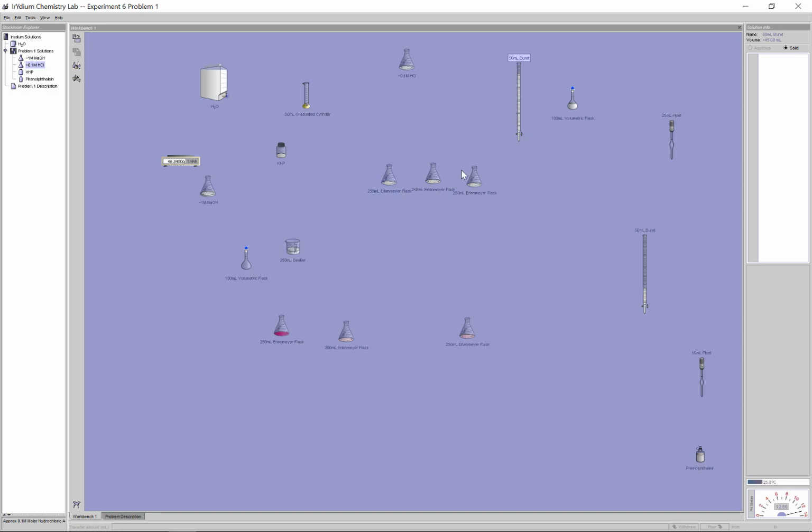Again, same problem. This one here would actually be colorless. So what I'm going to do here is I'm going to take my phenolphthalein here. I'm going to drop in a couple drops. So maybe, I don't know, 3 milliliters worth. I'm going to make sure to pour this in here. If you're not sure whether you've added phenolphthalein, just add more. It doesn't matter. So let's transfer in 3 milliliters. Let's say, oh, I don't know if that actually poured in. Pour in a little bit more.